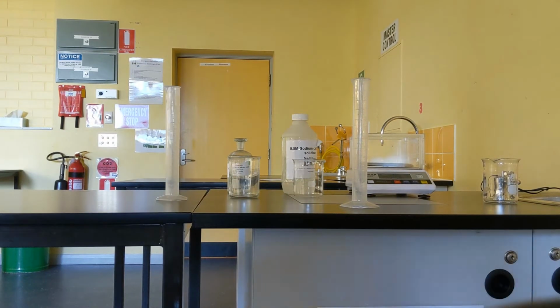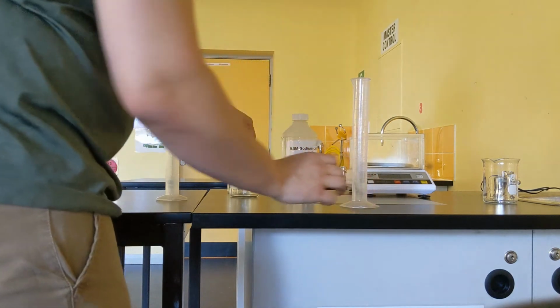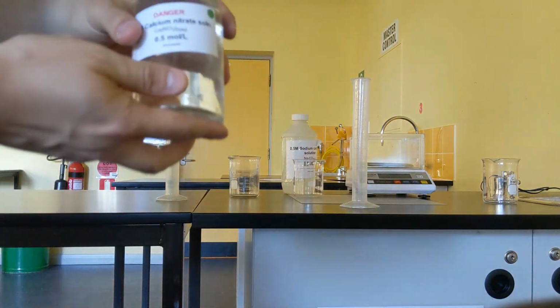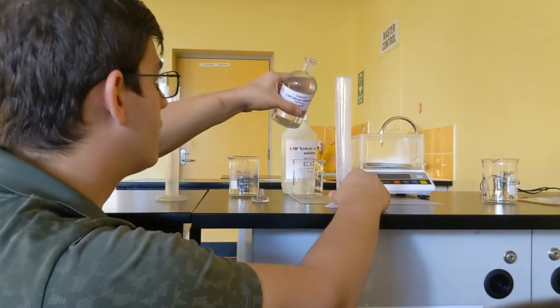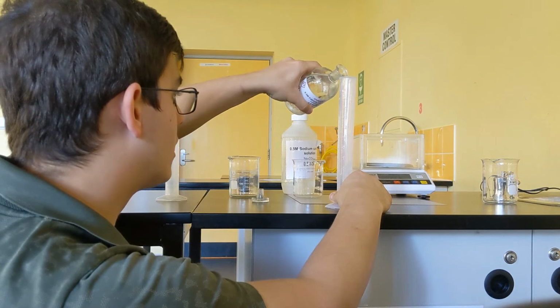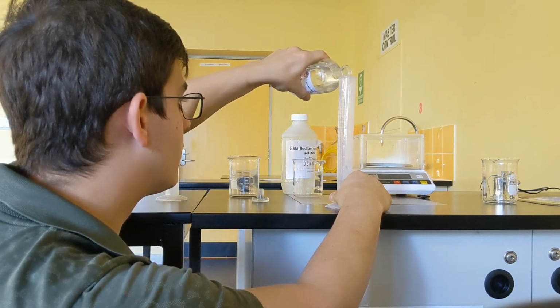So I have my setup. I have my two solutions and some beakers ready to go. Also got a couple of measuring cylinders. The first thing that I'm going to be doing is getting my calcium nitrate and getting that ready to pour. So I'm going to be measuring out 50 mils with a measuring cylinder. Doing that now.